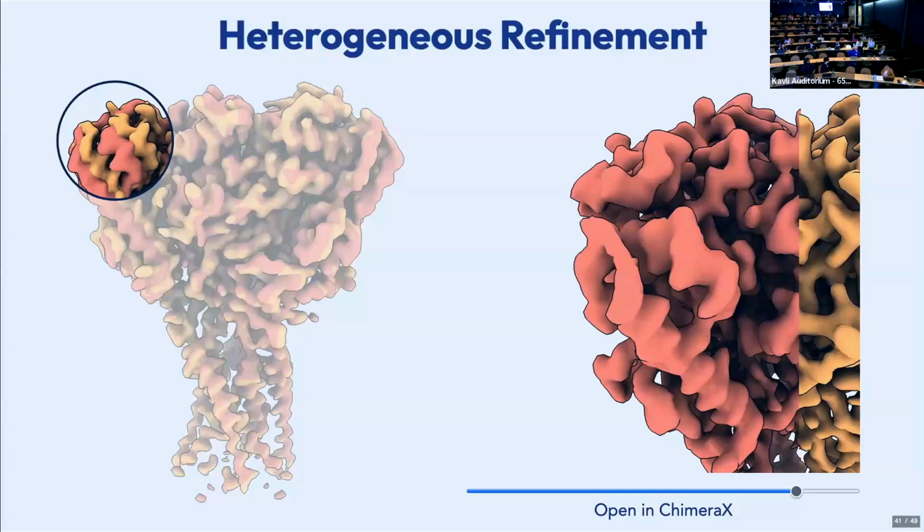As a result, I really encourage the community to deposit your data to EMPIAR. I tried to encourage NIH to set up a server or some mechanism, but at least some years ago they said, oh, it's so easy to get data, you just get it again. But actually, what they set up is S2C2 for you to get that again, which I like.